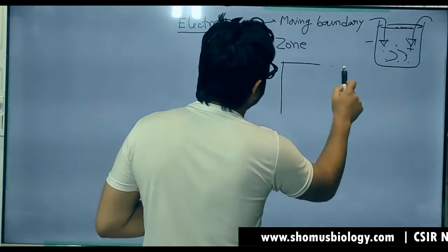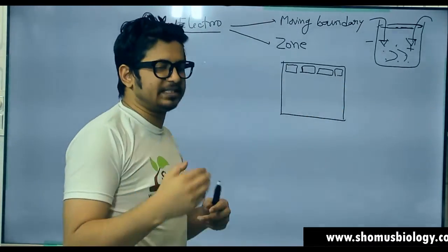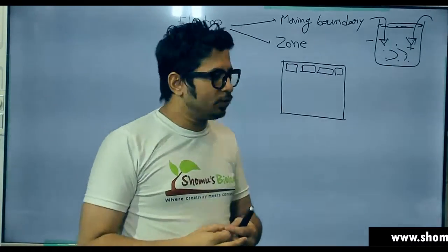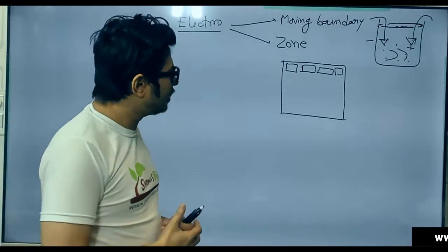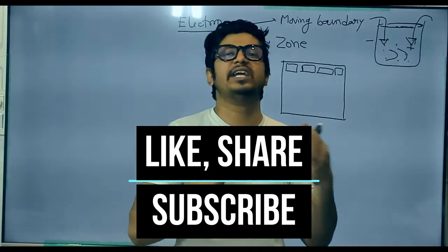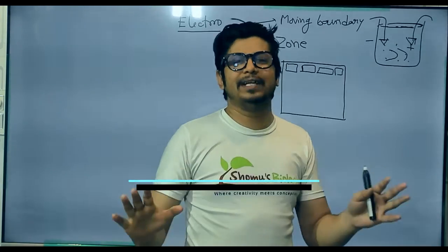While we also have a solid environment, let's say a solid gel. A solid gel has pores in it, but ultimately it's built with a solid material, that is agarose or polyacrylamide. That gel can resolve a mixture of DNA or proteins. When we use a solid medium, there is no change in boundaries because there is a fixed application. There is no change in boundary due to the solid nature of the medium. We call it zone electrophoresis. So that's the basic idea of electrophoresis.